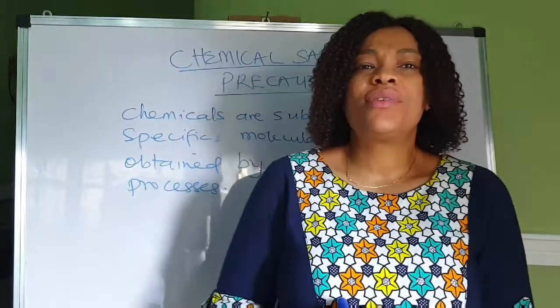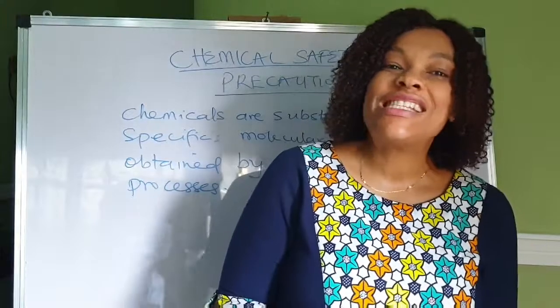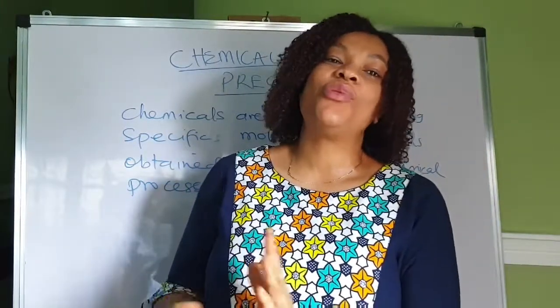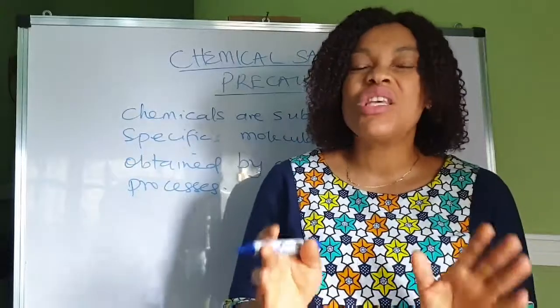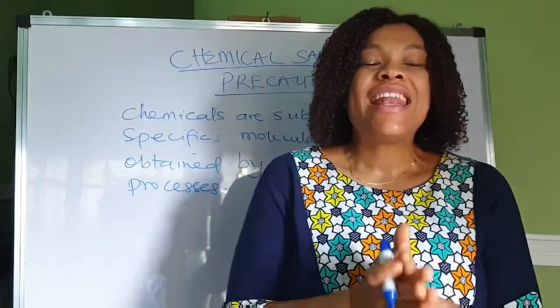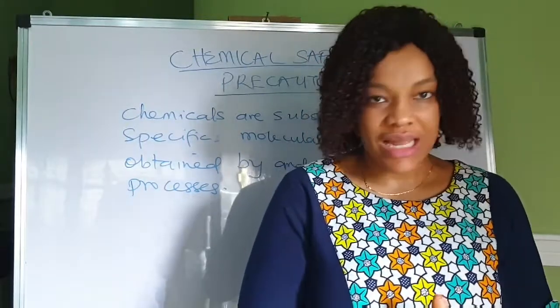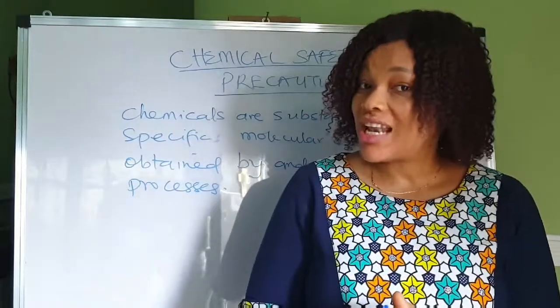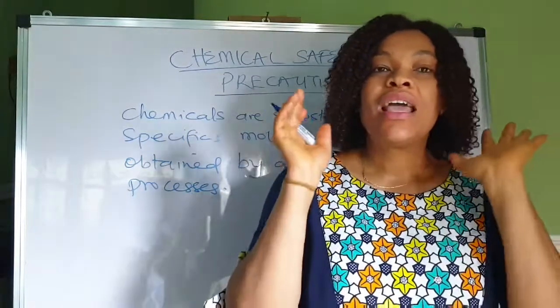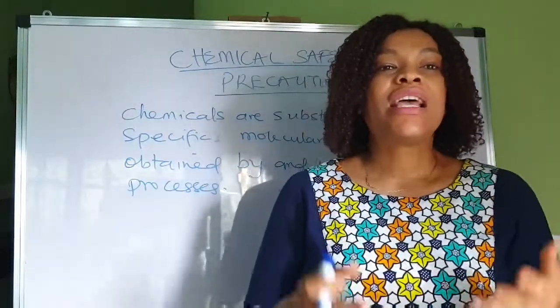Again, you have to use all materials solely for their intended purpose. So you don't bring an acid, for instance, and say there's no base in the laboratory, and then you want to use it in place of the base. You have to use each chemical for its intended purpose, and never eat or drink while handling any material in the laboratory. It's very dangerous to eat or drink in the laboratory. You have to store all materials in properly ventilated, dry, cool areas.